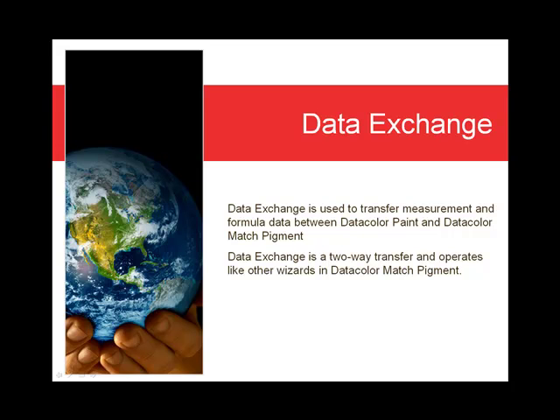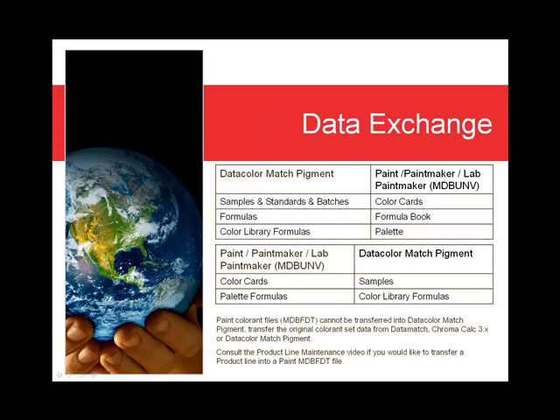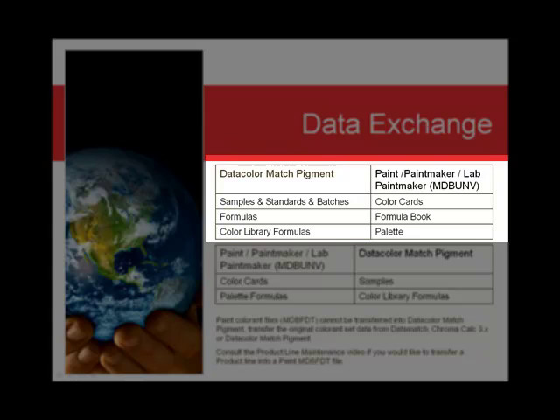Data exchange is used to transfer measurement and formula data between Datacolor Paint and Datacolor Match Pigment. The following data can be exchanged. First, from Match Pigment to Paint, PaintMaker or LaPaintMaker.